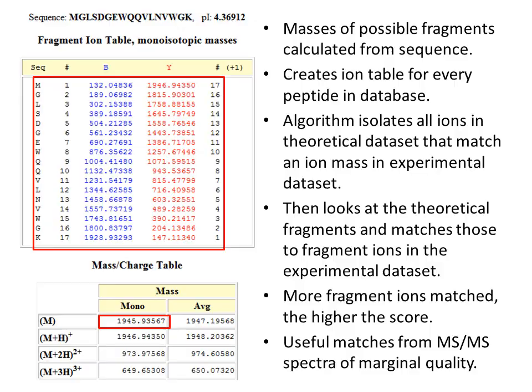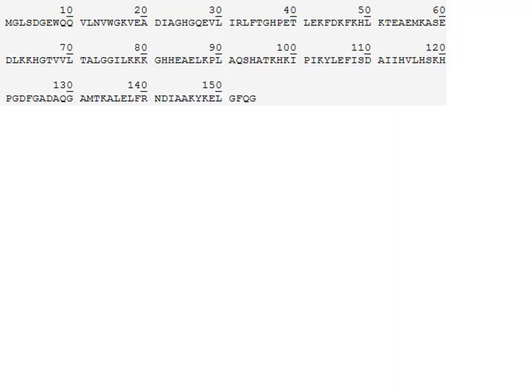peptide was fragmented. We're going to swap example peptides from myoglobin and use this second tryptic peptide. The peptide has an intact mass calculated from the amino acid sequence of 1605.8 Daltons. If ionized by MALDI, which produces predominantly singly charged ions, the mass detected by the mass spectrometer is 1605.8 plus a hydrogen ion.